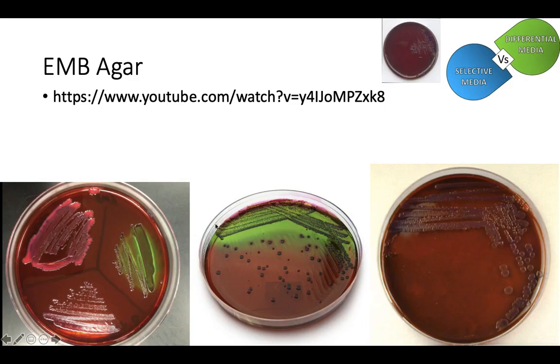Now, this particular agar is differential and selective. So it is selective, and let's talk about what does the killing in this. Now, in this case, EMB agar stands for eosin methylene blue. Eosin and methylene blue. Eosin is a dye, which gives it this purple color. Methylene blue is also a dye, the same thing that we use for simple stain. So eosin and methylene blue are dyes that have been added to our nutrient agar, essentially.